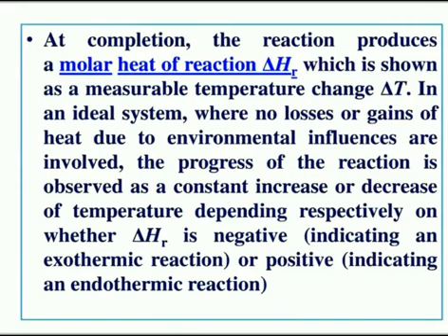If delta H, the change in enthalpy, is negative, then the reaction is exothermic, and if it is positive, then the reaction is endothermic.